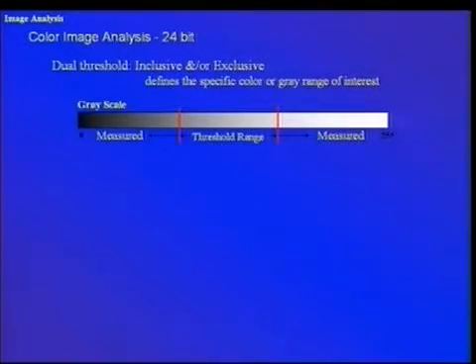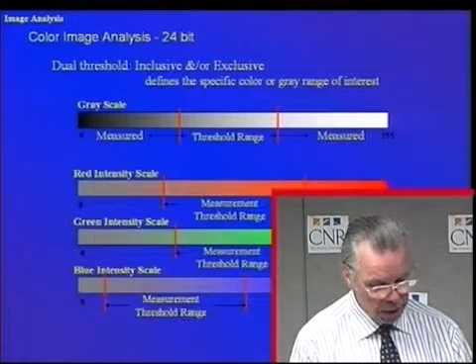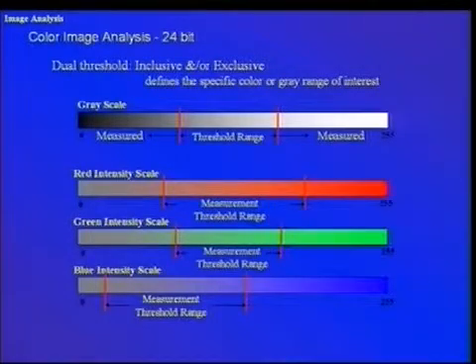In this case, we use a dual thresholding technique, which is a bit more computationally intensive than in the ordinary dirt counting environment. With that, we have concluded the presentation. I will now show you in the laboratory how we can do these various measurements.